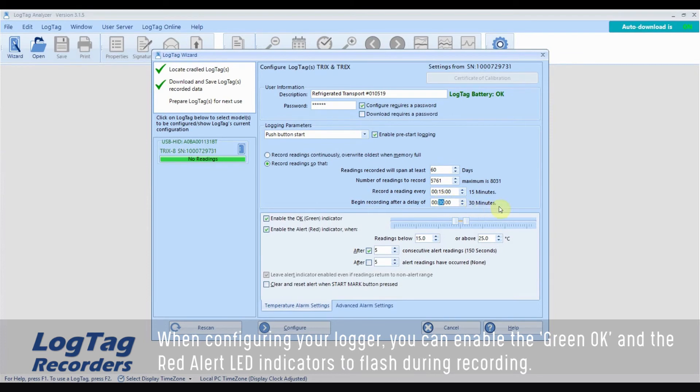When configuring your logger, you can enable the green OK and the red alert LED indicators to flash during recording.